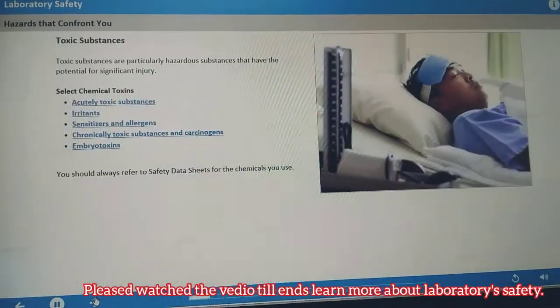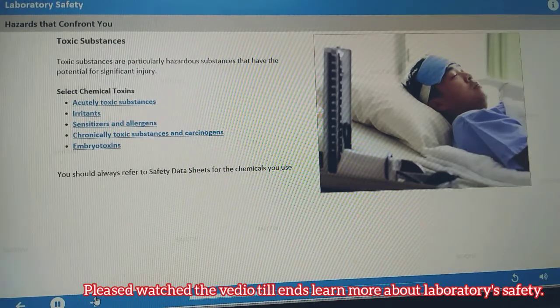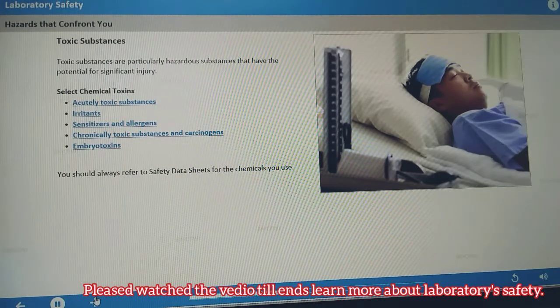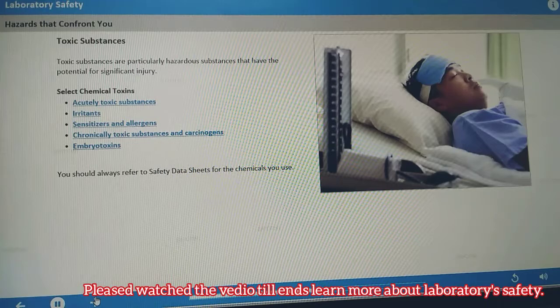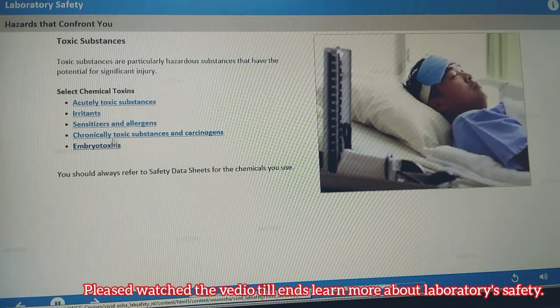Toxic substances are particularly hazardous substances that have the potential for significant injury. Some are in a select category of chemicals due to the nature of injury.